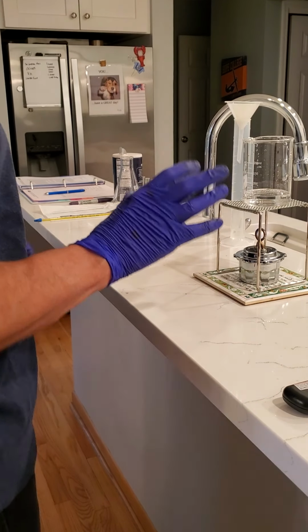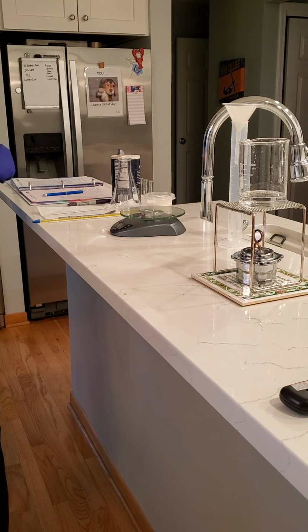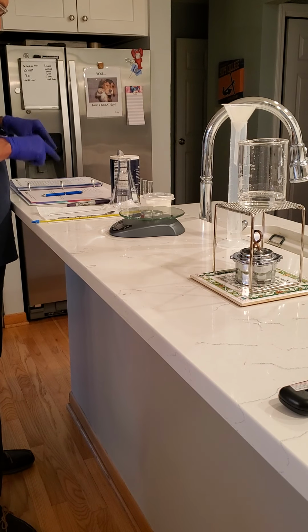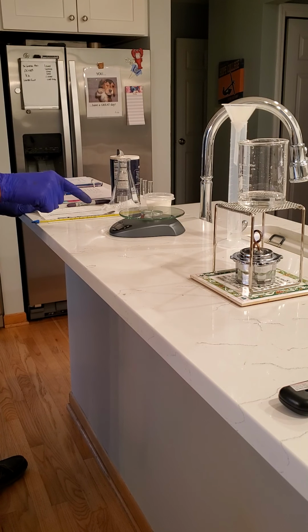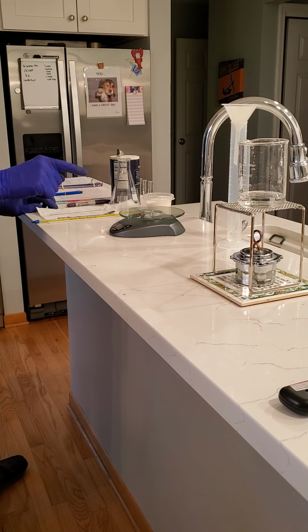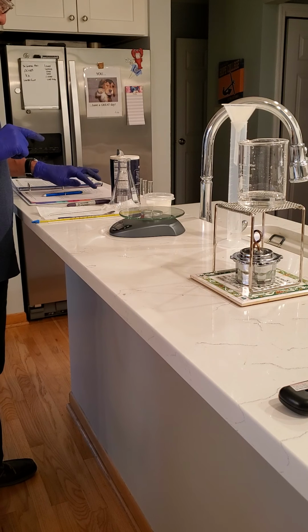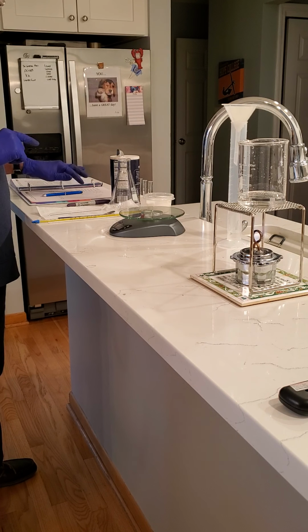Okay, class, so I've got the beaker on the burner and we're heating this up so the water will evaporate. I want to call your attention to a mistake in the numbers I gave you. I inadvertently had set my scale for measuring ounces instead of grams. So the numbers you should have for the empty beaker is 116 grams. The mass of the beaker plus solution is 161 grams. That gives you a mass of the solution as 45.1 grams.